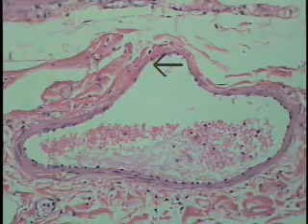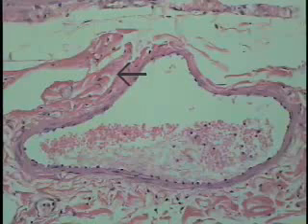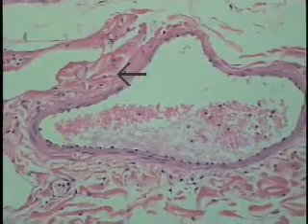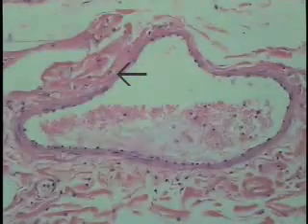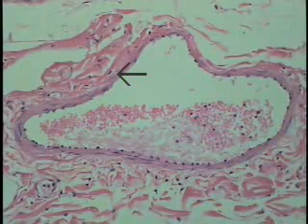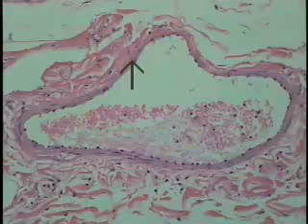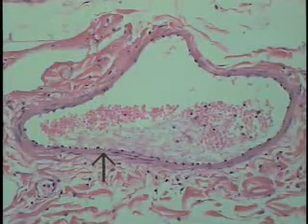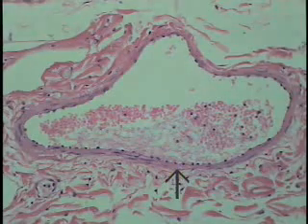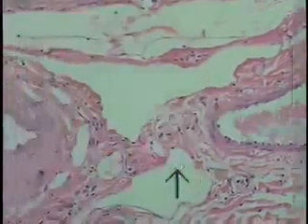The intima, of course, is always going to be there with its endothelial lining and a small layer of this subendothelial connective tissue. So this is a fairly decent example of a small vein and the initial appearance of the smooth muscle in the tunica media, even though it's much less well developed when you compare it to its companion artery, in this case the small artery here, which is much more robust and has that very prominent muscular media.